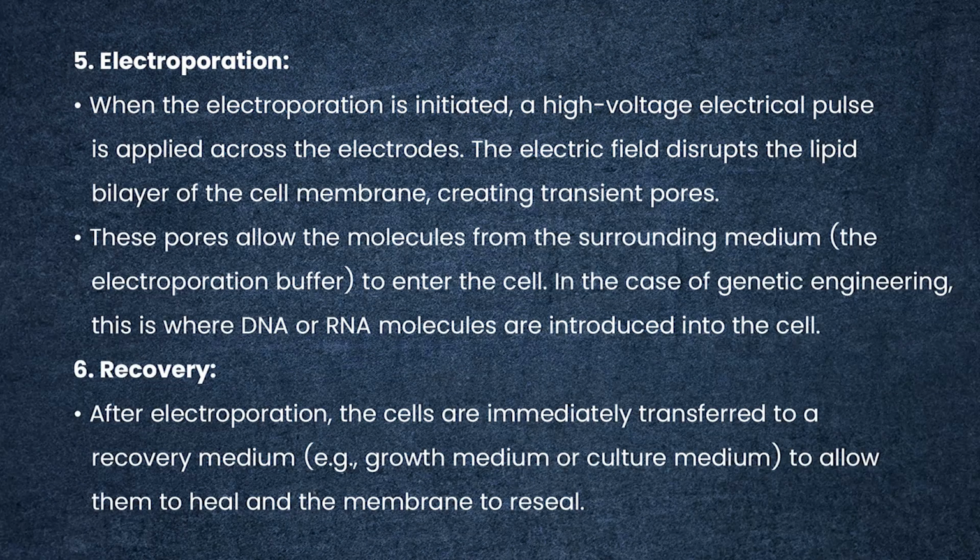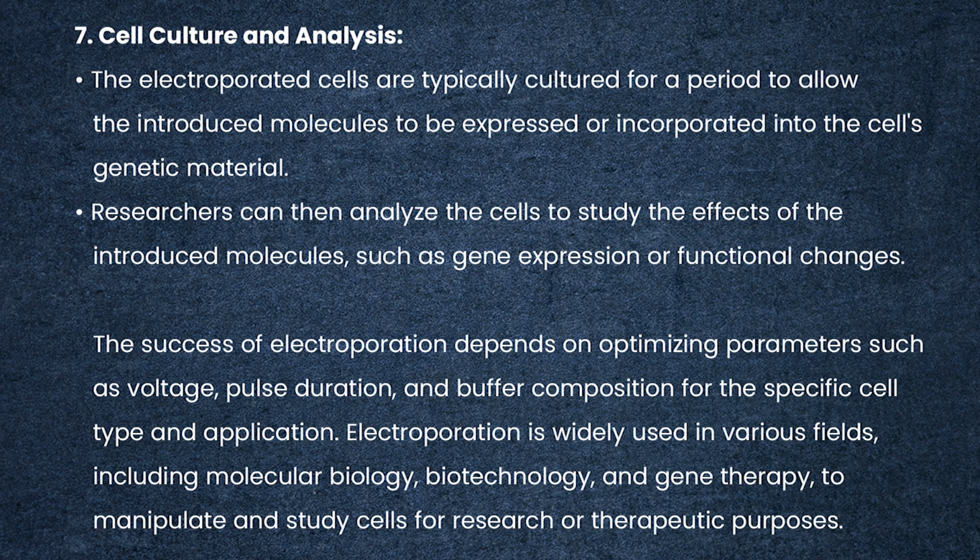For the recovery of the cells after electroporation, the cells are immediately transferred to a recovery medium, that is the growth medium or culture medium, to allow the cells to heal and the membrane to reseal. Now, finally, the cell culture and analysis. The electroporated cells are typically cultured for a period to allow the introduced molecules to be expressed or incorporated into the cell's genetic material.